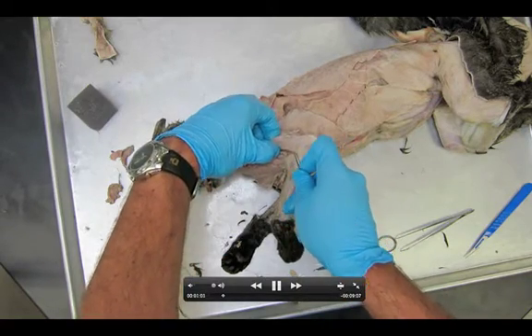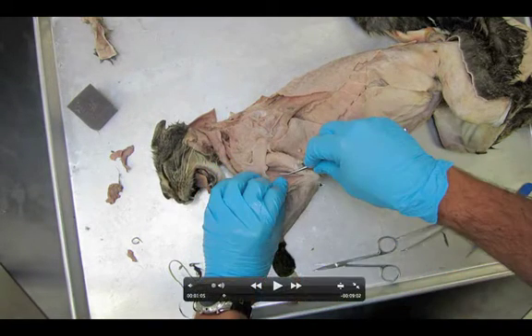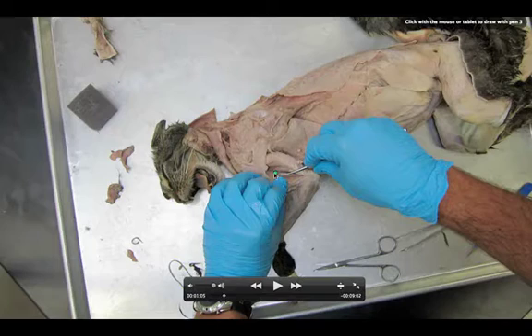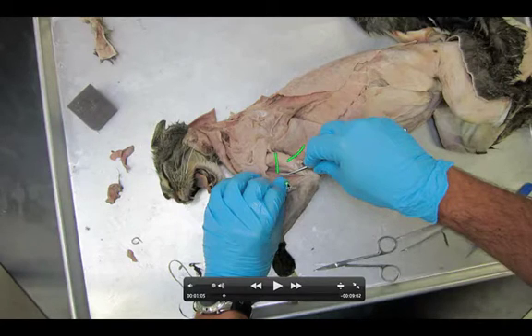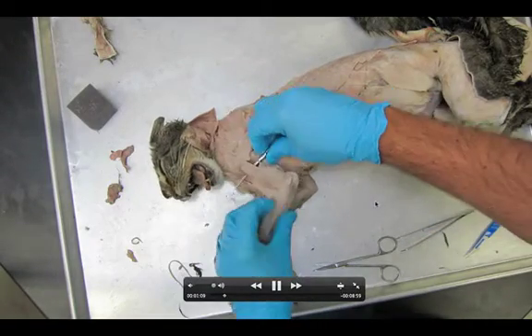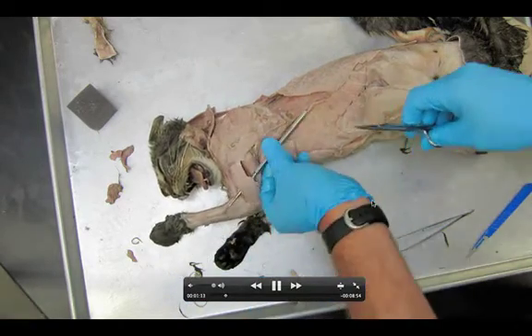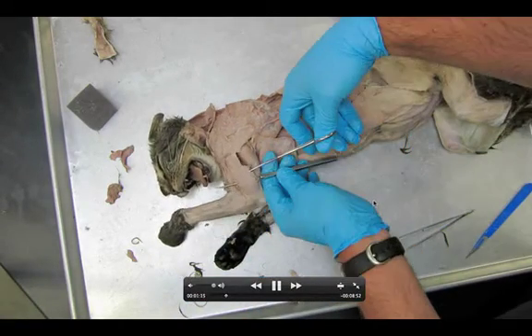I'll get my probe underneath it, being careful not to hook anything down deeper. It's a very thick muscle. Right where the probe is, you can actually see the medial head. You see the medial head, you see the long head — so long head, medial head, lateral head. The three different triceps, obviously triceps being three. I'm going to get underneath the triceps lateral head, make sure it's freed up back and forth. That's actually going to be cut in half — that's pretty much the only muscle we're cutting on this dissection.